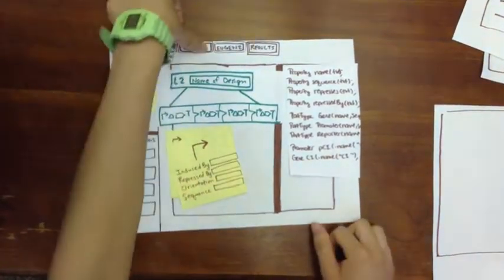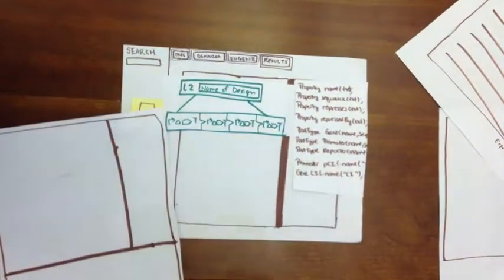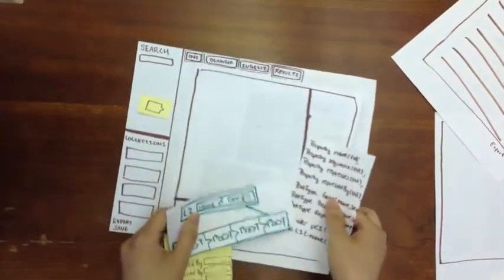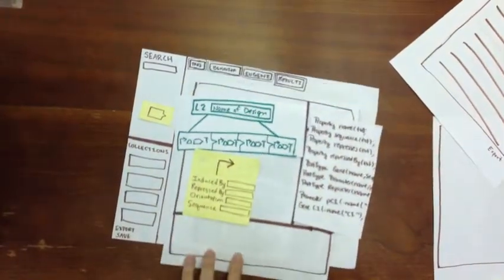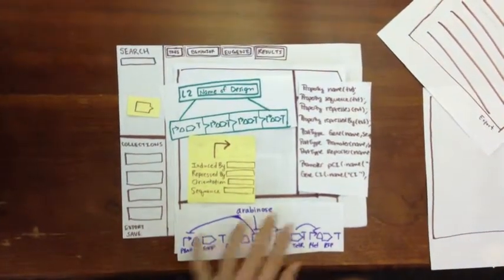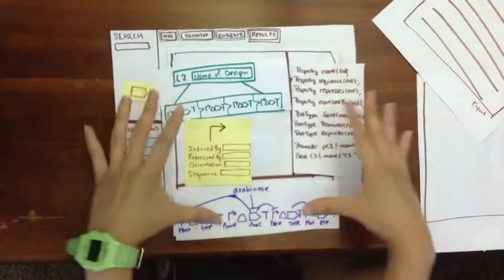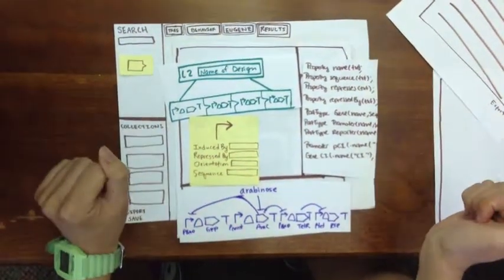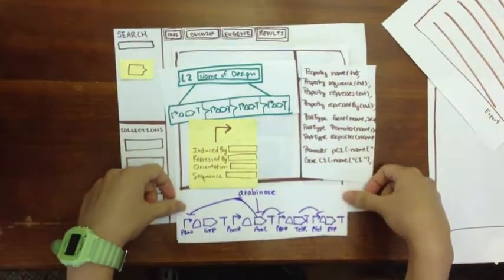We can also view behavior simultaneously, and so we would have 3 panes, and we can view the tree here, the Eugene code here, and the behavior of the different parts and devices in this area. And so all of this is tied together, and so you can view the tree, the code, and the behavior of the parts.